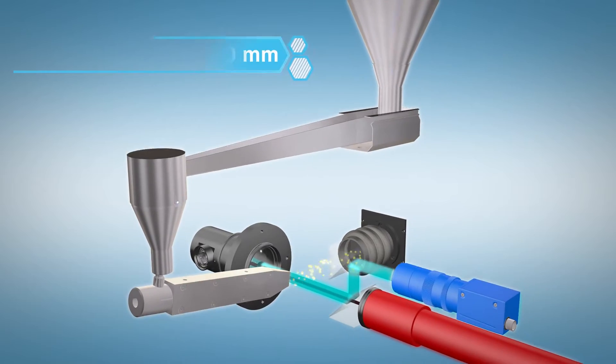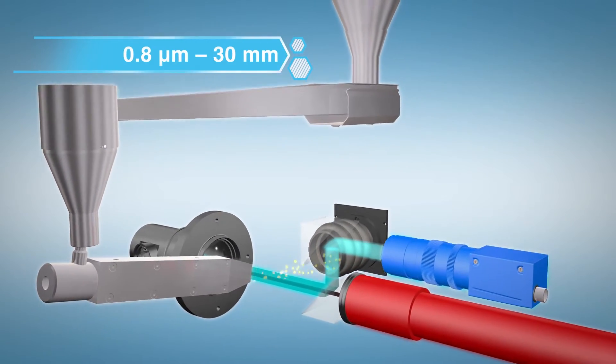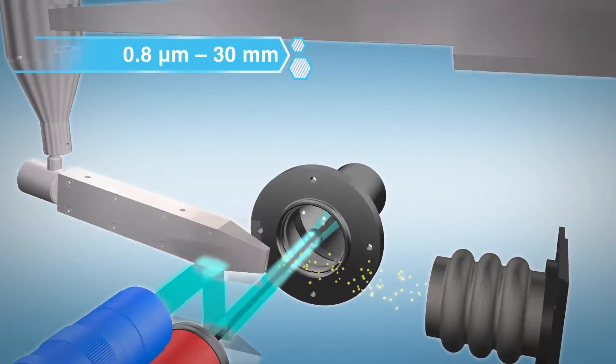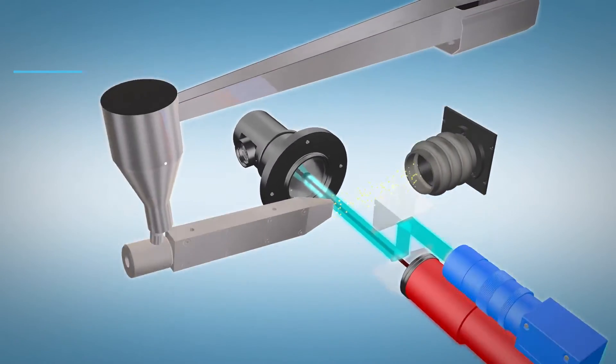Depending on the instrument, particles in a size range from 0.8 microns to 30 millimeters are characterized as powders, granules, or suspensions.